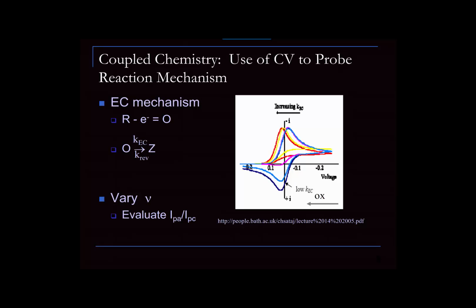Something else that's really cool about voltammetry is again given based on not having perfect redox waves. You can actually begin to get insight into complex reaction chemistries. You can generate intermediates that are interesting, capture them, stabilize them, probe them spectroscopically. You can follow their kinetics, things again that are very unstable. And on this slide, I just want to show you an example of this.